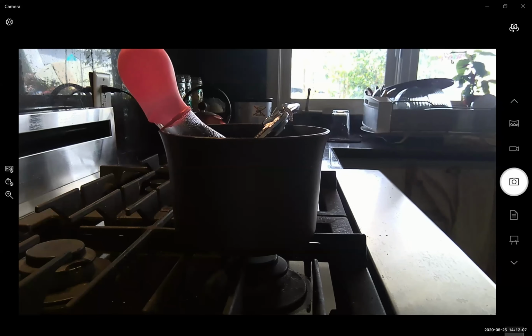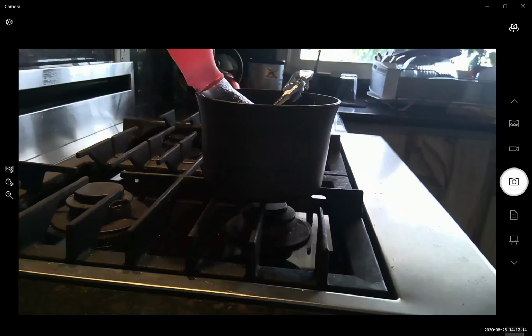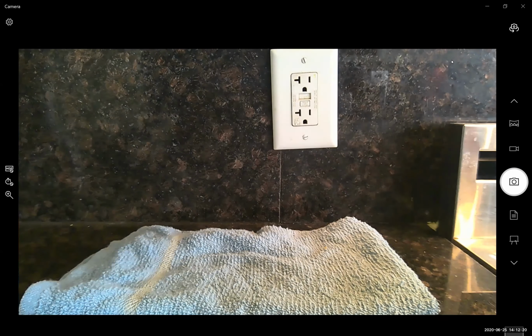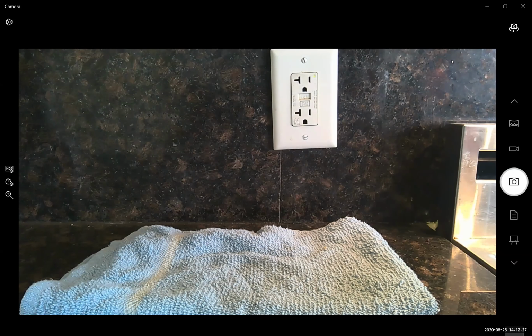Okay, so we finished heating our sample, and as we can see, the volume of our balloon has substantially increased. So what we're going to do next is move our balloon onto a heat absorbent pad using an insulated glove.